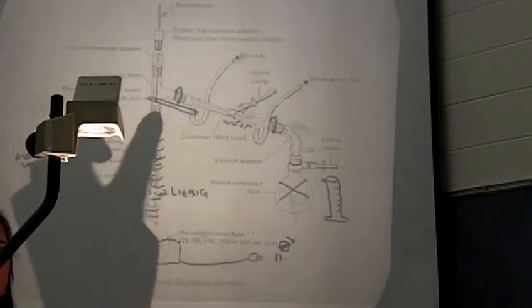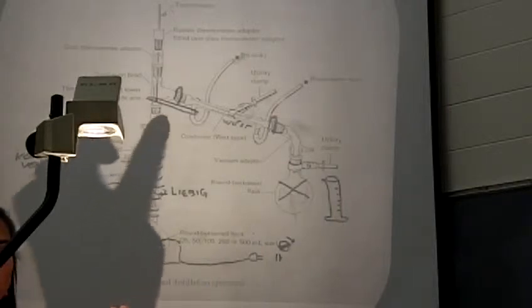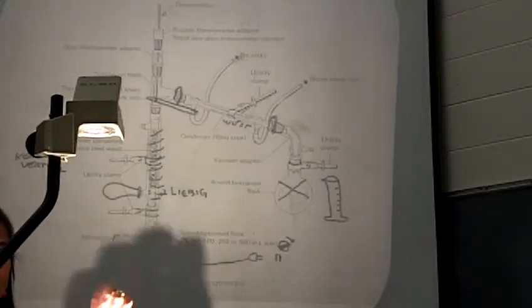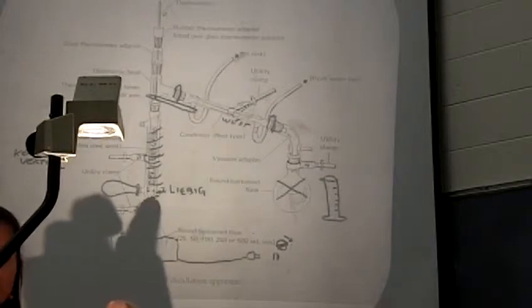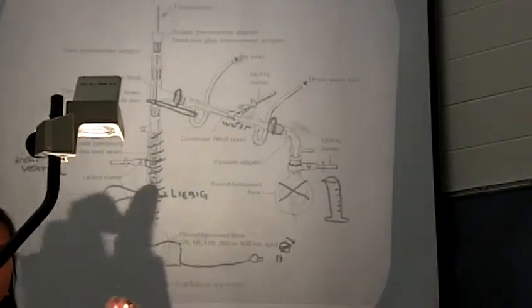Then you're going to clamp that Liebig condenser, okay? And before you put that condenser on, you stuff it with steel sponge, which we'll show you in lab this week how to do. When you're stuffing it with the steel sponge, you have to be careful. There are some little prongs in here that are easily broken. If they break, they ruin the condenser. So be really careful when you're putting the steel sponge in there not to break the prongs, okay?